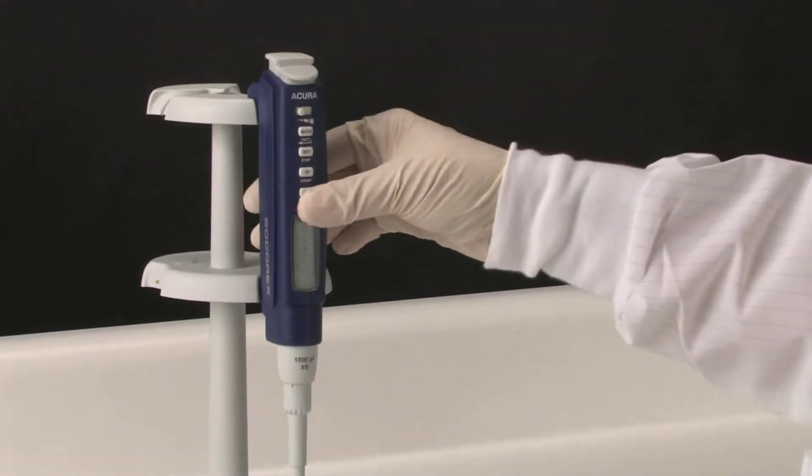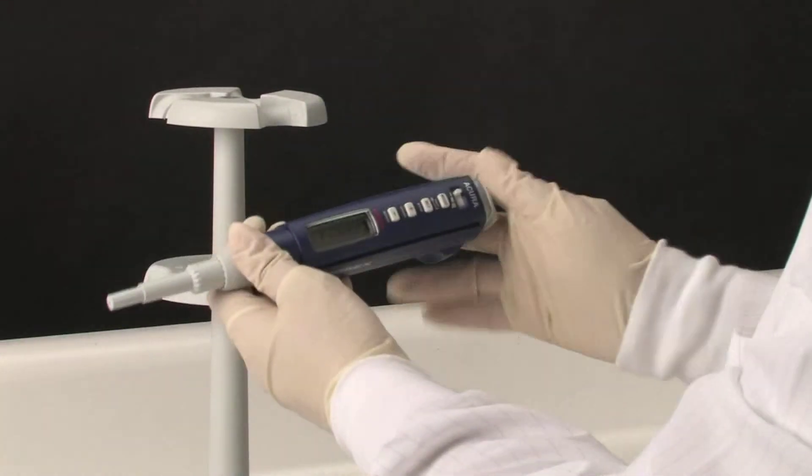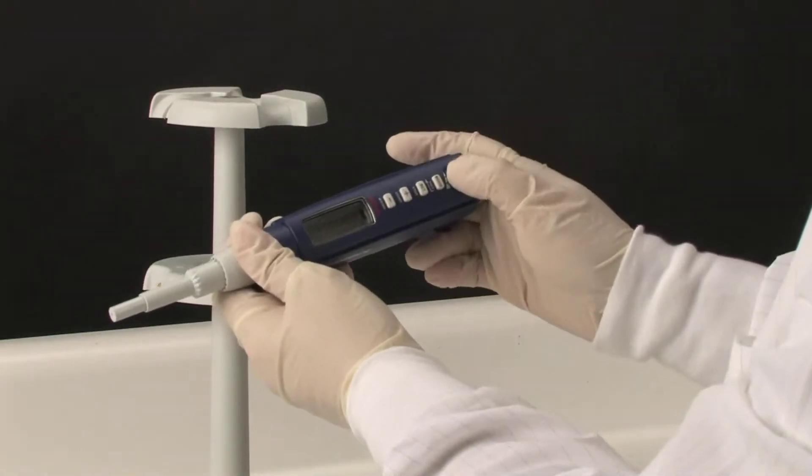Acura Electro Pipettes are designed and engineered to be comfortable, user-friendly, as well as easy to maintain.